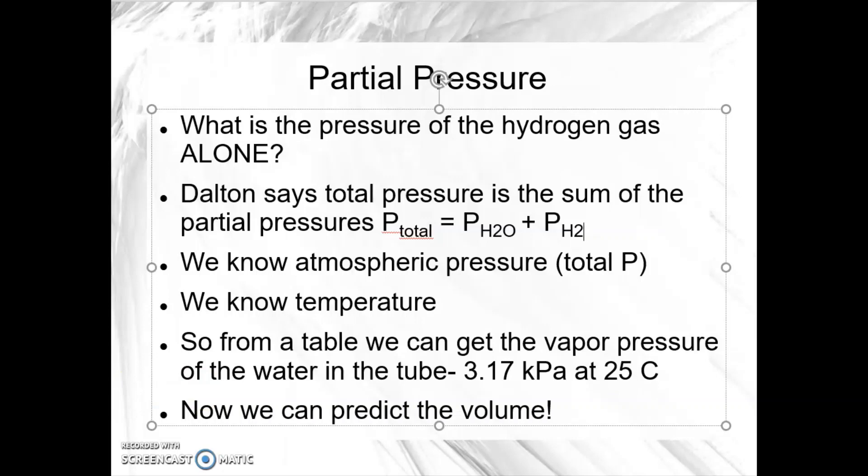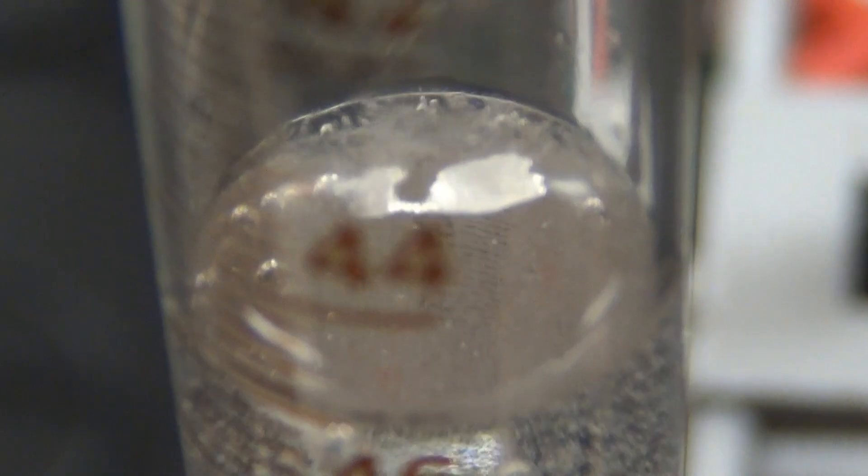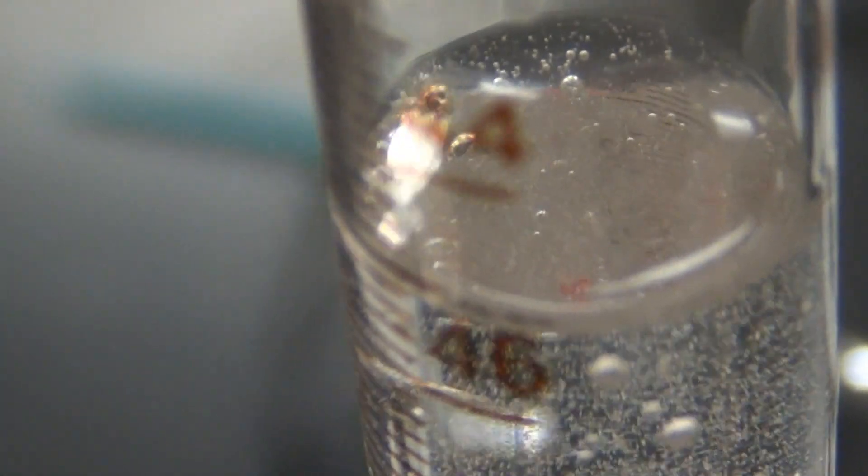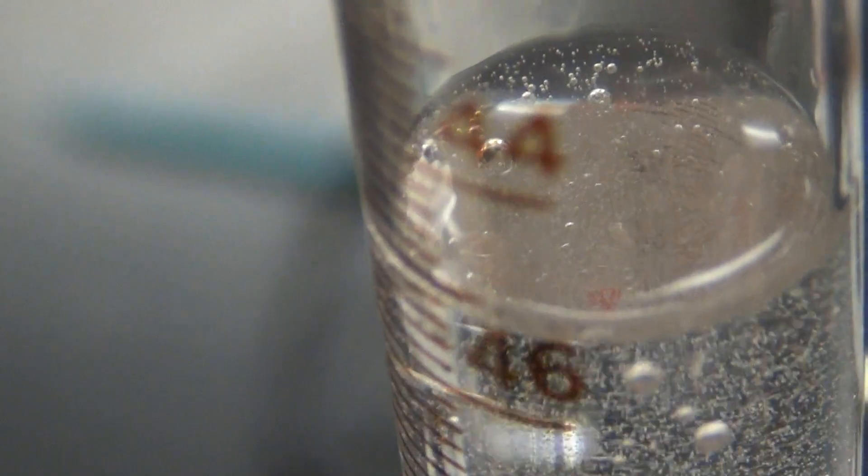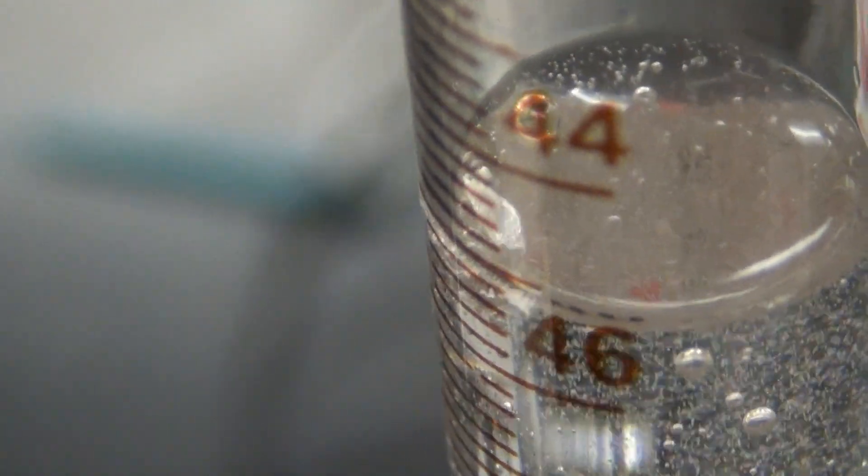So you need to get a predicted number, put that in your lab notebook, put a little box around it because you will need that later. So you can see here, now this strip is so small that it's actually managed to get loose of the cage and it's now floating at the top of the water and the hydrochloric acid solution. So we're going to have to watch that and make sure that it's all gone before we decide that we've finished our reaction.